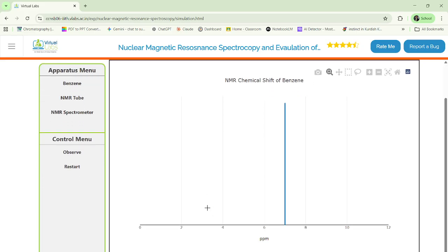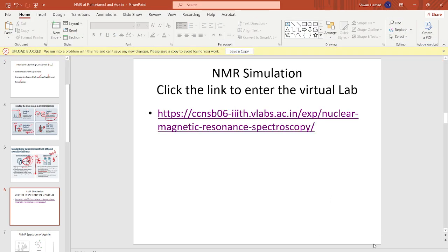So draw this and talk about it as well, and say this is the chemical shift. This is TMS. This is benzene. We get one signal because we have 6 hydrogens, but they are all chemically equivalent, so all the signals will be in the same area. Therefore we have one long signal which is integrated for 6 hydrogens, 6 aromatic protons. Okay, that was it. Let's go to the other thing.